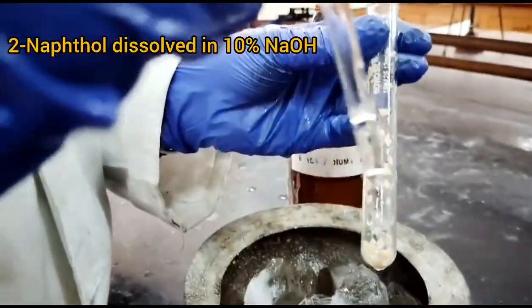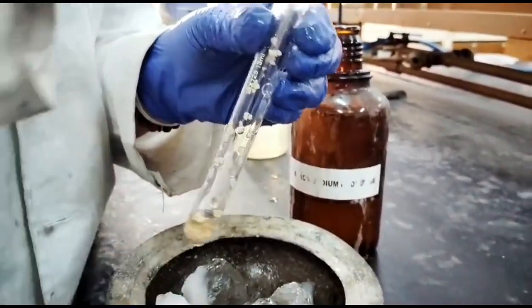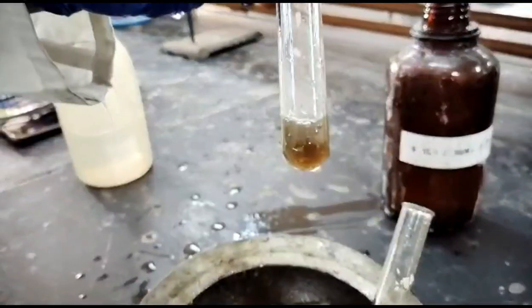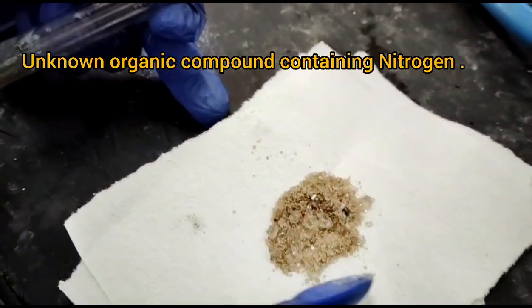We are adding 10% NaOH to beta naphthol to make its solution. We'll shake it properly so that it dissolves in it. It has almost dissolved. This is the organic compound containing nitrogen group.